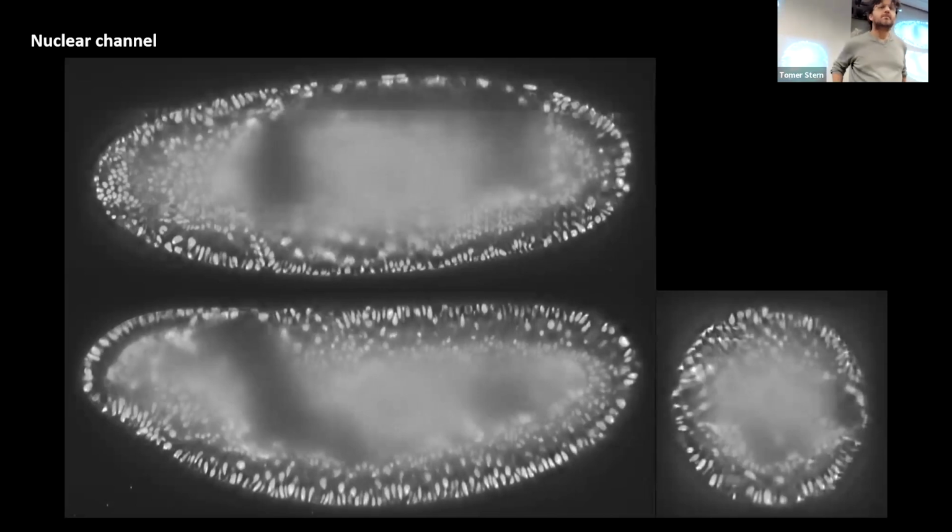How big are those files? Before, after reconstruction. Well, just any way you want to answer. Just the raw data. We're easily generating terabytes a day. Yeah, but we throw most of that because you're collecting 2 cameras at the same time. You don't need that. We fuse that. And then when we fuse that, it becomes half. And then you can shift it to 8 bits, and you don't need the full resolution. So let's say that each one of these movies is like 100, 200 gigs. Let's say like a gig or 2 per time point, if you want a good quality. H5 is very helpful. You can compress it very well.